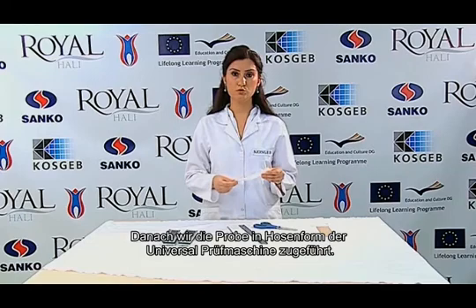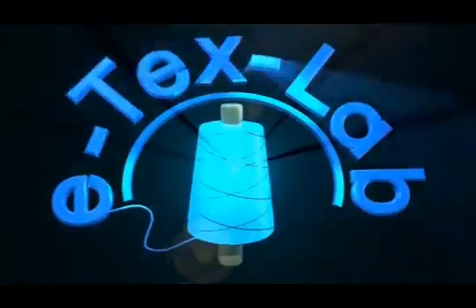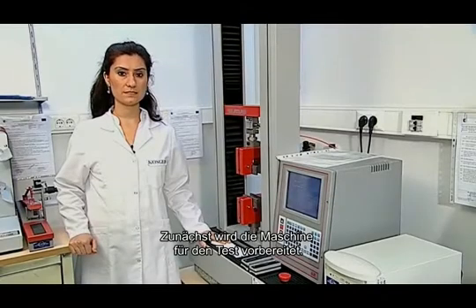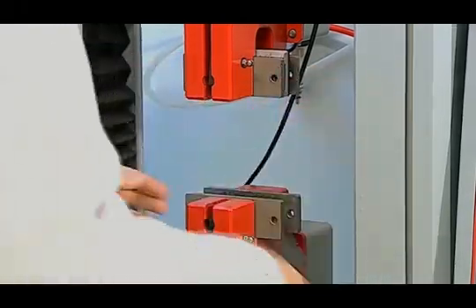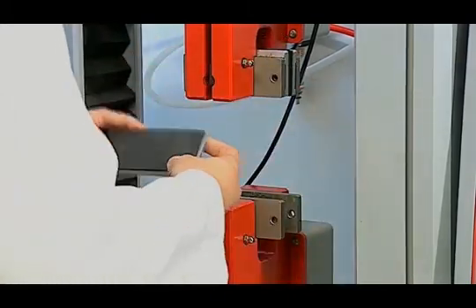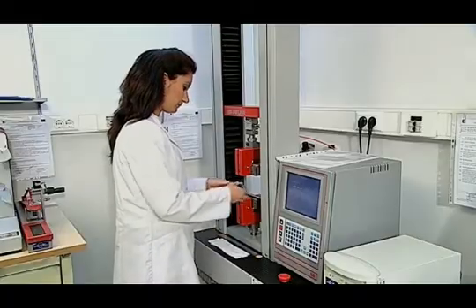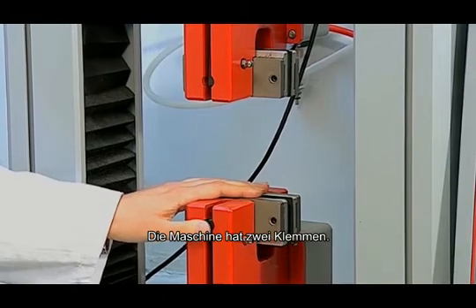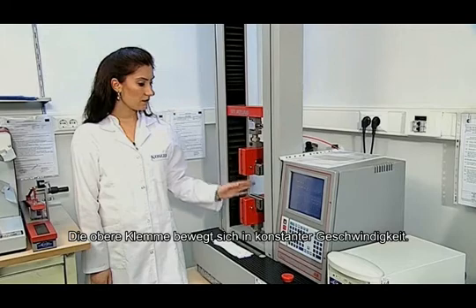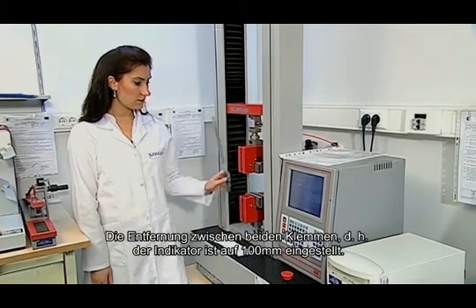This trouser-shaped specimen is subjected to the test in the universal test machine. The device is prepared for the test and placed into the device for a single tear. The device has two jaws: the lower jaw is fixed and motionless, and the upper jaw moves at stable speed. The distance between the two jaws, that is, the gauge length, is set to 100 mm.